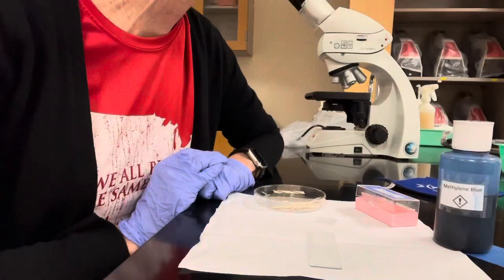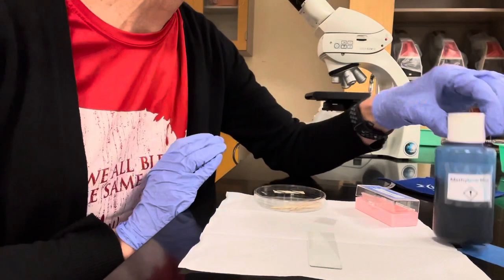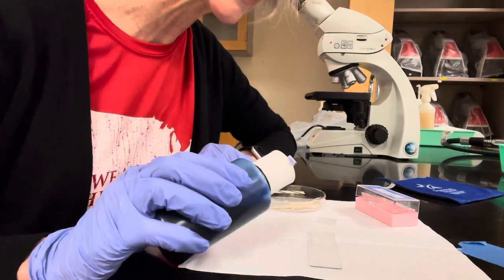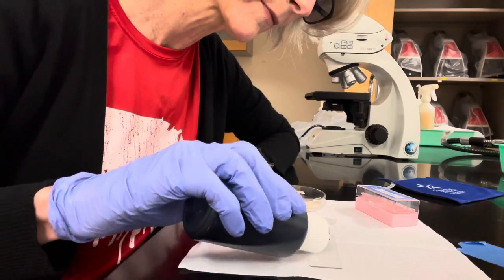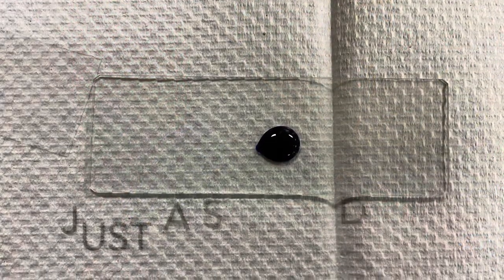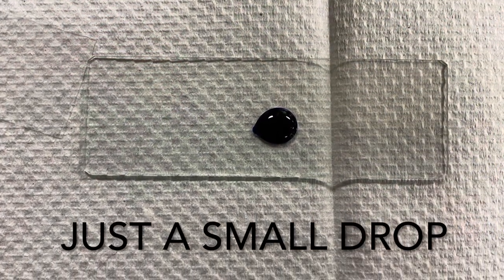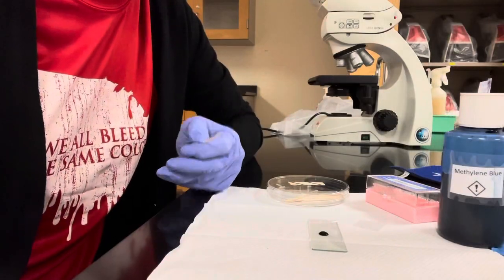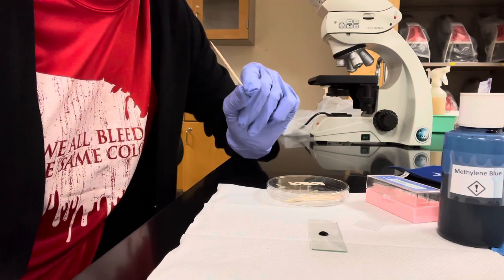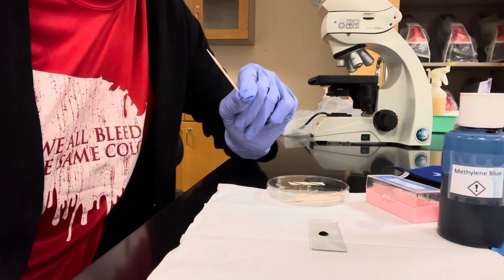To make the wet mount, the first thing you want to do is take the methylene blue and put a small drop in the center of your slide. The next thing you're going to do is take your sterile toothpick and scrape cells from the inside of your cheek.